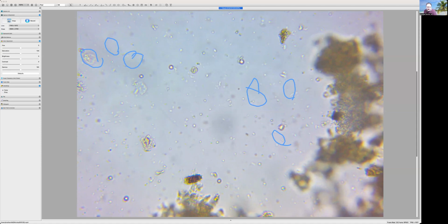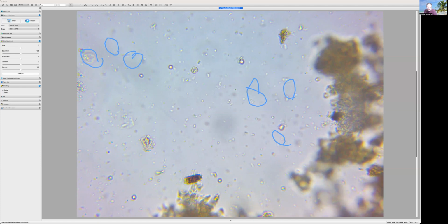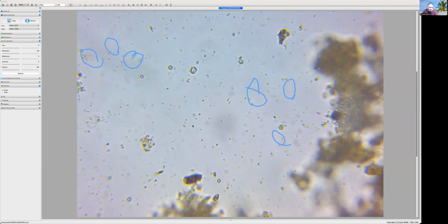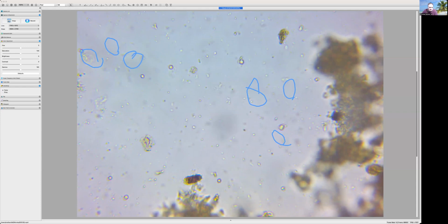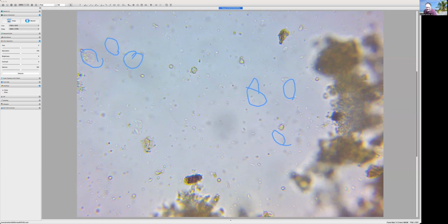It looks similar to a naked amoeba, but it's not. Boy, the flagellates have just gone crazy. So I've added a stimulant in here so that it would increase the food supply for these flagellates and protozoa. So it sure worked. This is great.